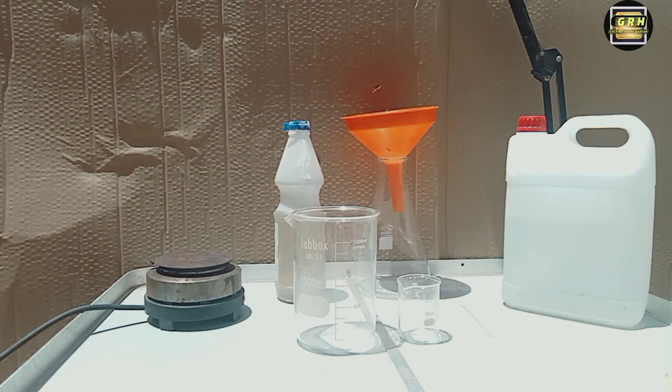Hello everybody, I hope you are doing well. In this video I will show you how to make iron sulfate.